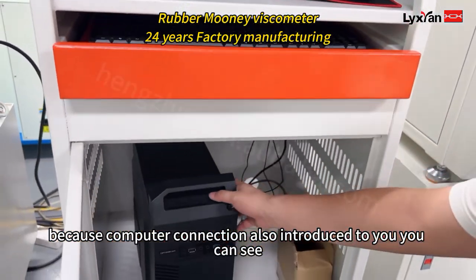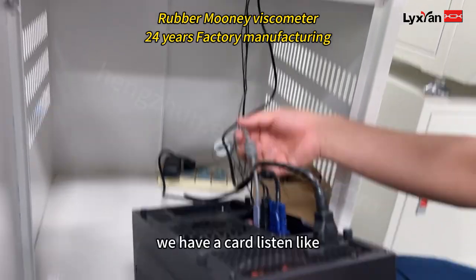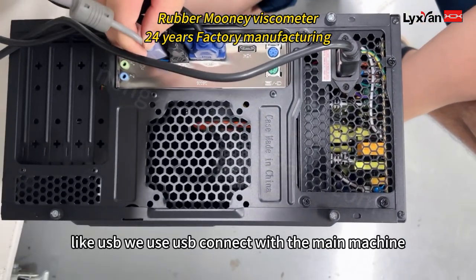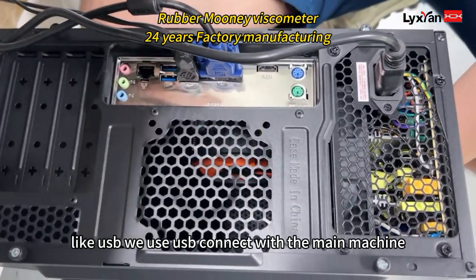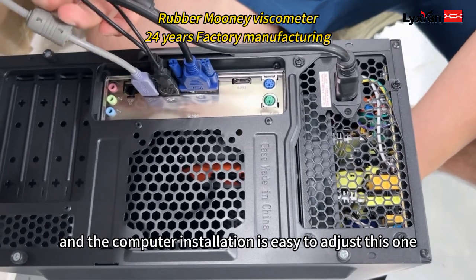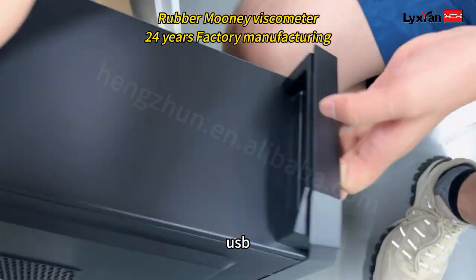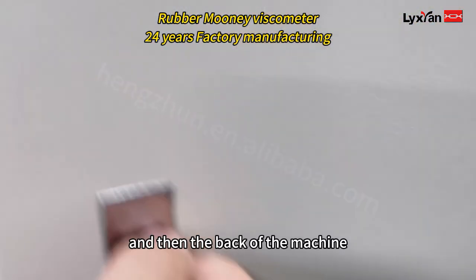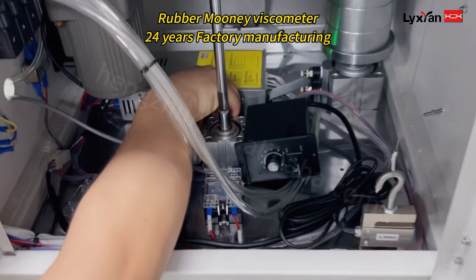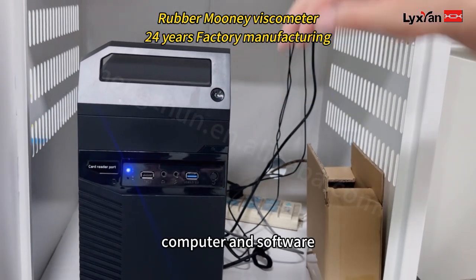For computer connection, you can see we have a port here — just like the internet, like a USB. We use USB to connect with the main machine. The computer installation is easy — we just use USB and connect it with the main board.